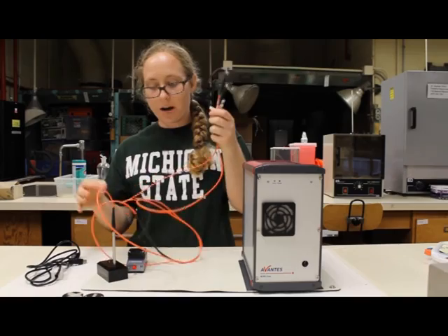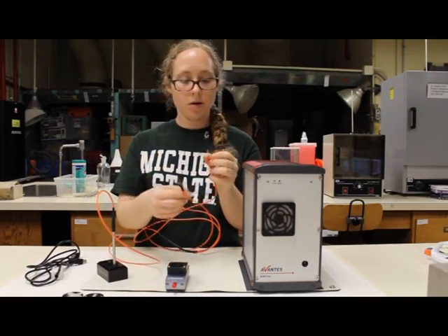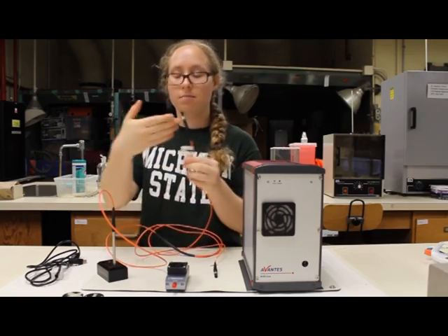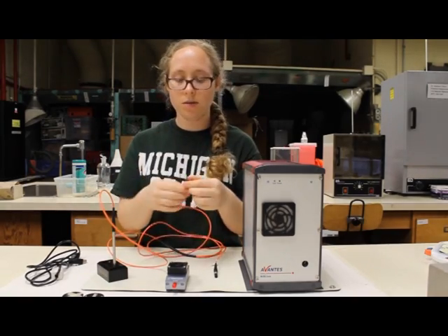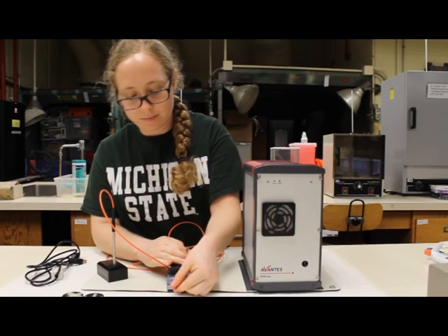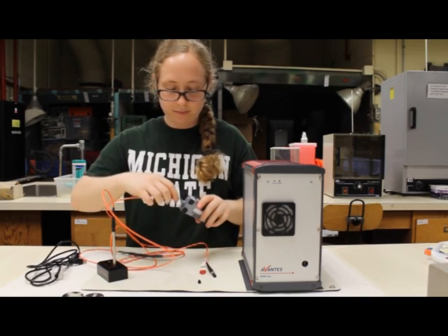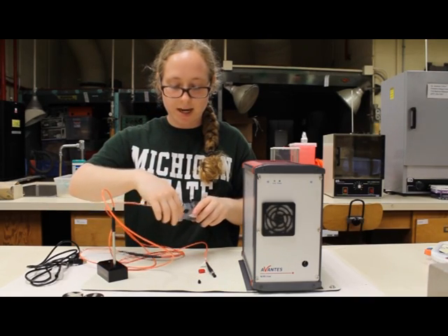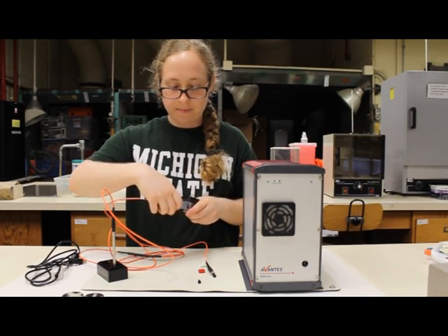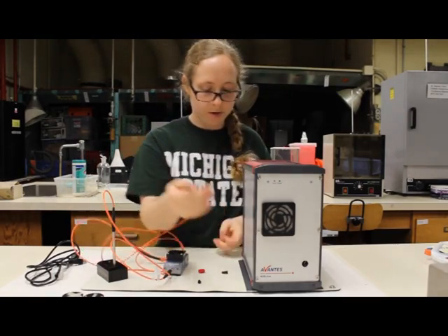The connecting fibers on the reflectance probe — one goes to the light source. It's the one on the probe that says Photon Control, so that goes directly to the light source. The one that says center fiber goes to the spectrometer.